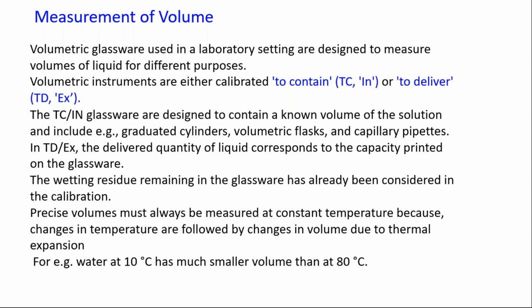I don't know how many of you have looked at the volumetric glassware, especially the standard flasks, the volumetric flasks, the measuring cylinder, and the pipettes. And if you have noticed an inscription on them which says TC or TD. What does this stand for?